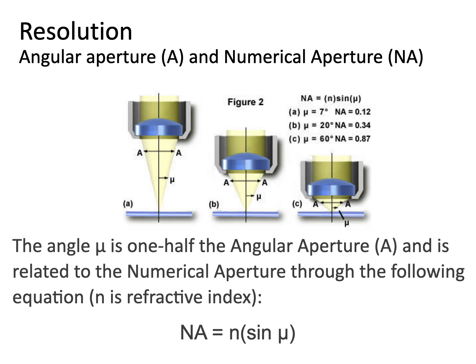So your numerical aperture, your NA, is going to go up as your objective becomes stronger, right? Because if you look at the figures, as you move to the right, your objective becomes stronger. And as you move to the right, that angle becomes larger, right? So as that angle becomes larger, your NA also becomes larger. And then the illustrator who made this figure has also thrown up there the way that the mu, or that angle, is tied to the NA. So that's pretty useful there.